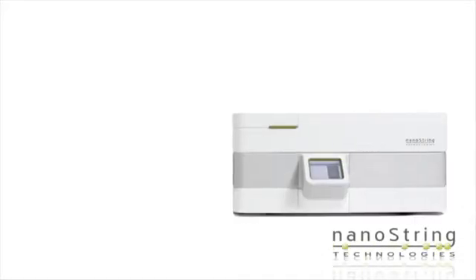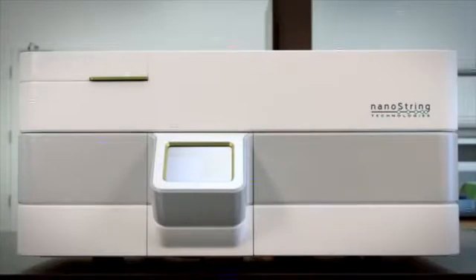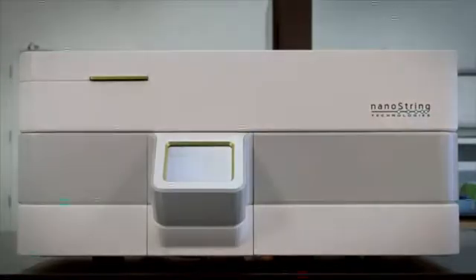In this tutorial, we will show you how to scan your samples and collect your data from your nCounter hybridization experiments. To set up a scan on the digital analyzer, you will need to have a cartridge prepared by the prep station, you'll need to have a reporter library file, and we will need a cartridge definition file.